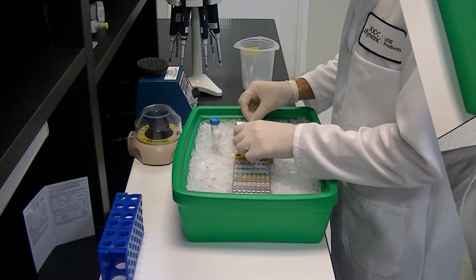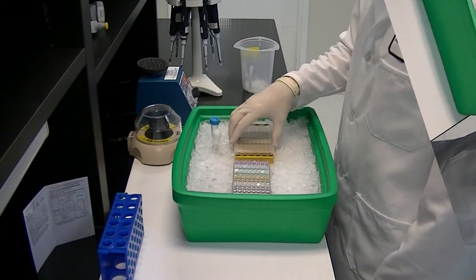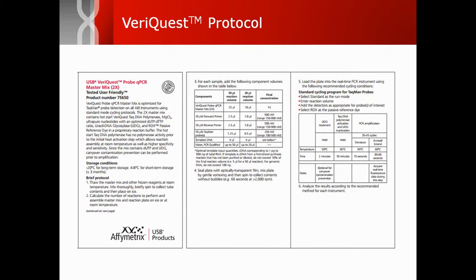After adding all reagents, seal the plate and gently vortex. Spin to collect contents and load the plate onto your real-time PCR instrument. Follow your instrument provider's setup instructions, being sure to apply VariQuest cycling conditions defined in the protocol that can also be downloaded from our website.